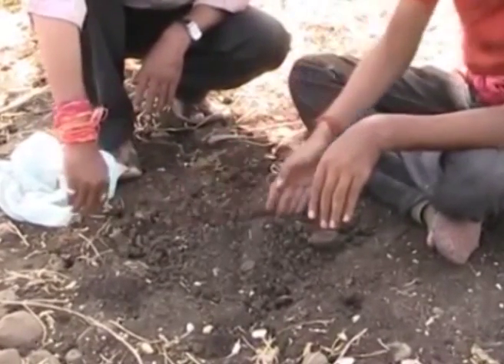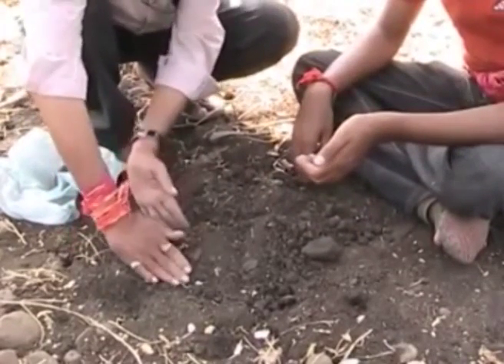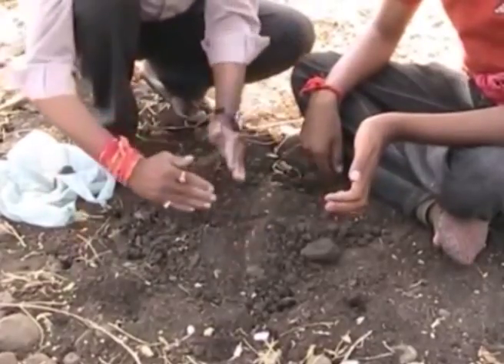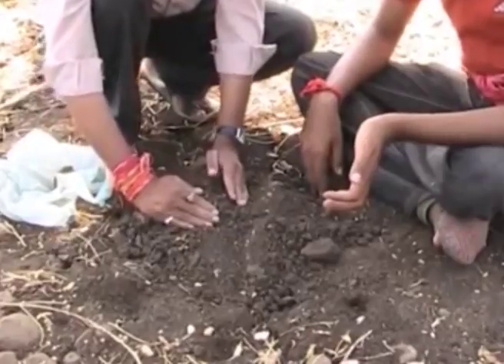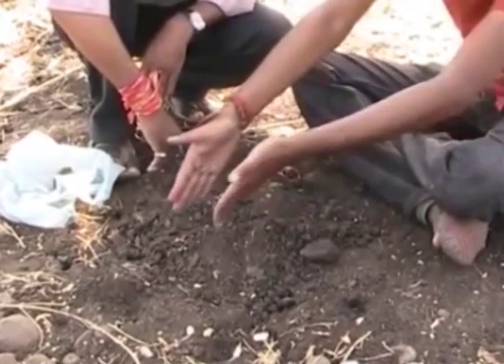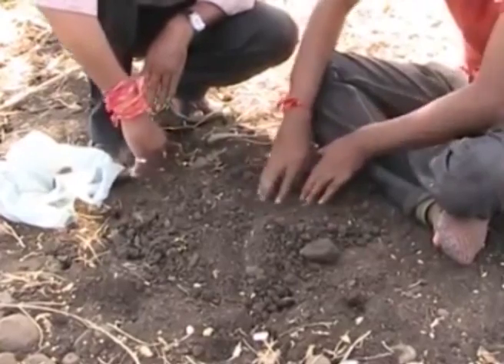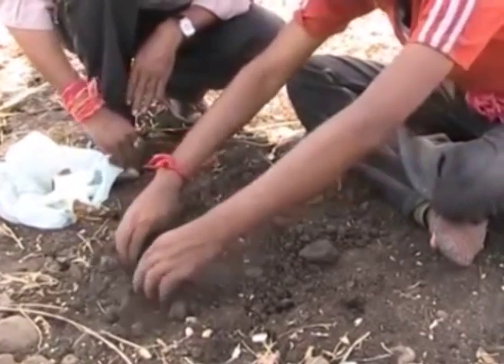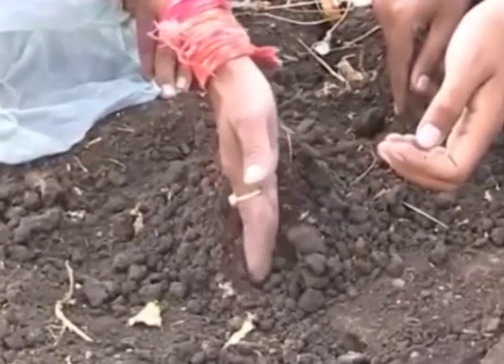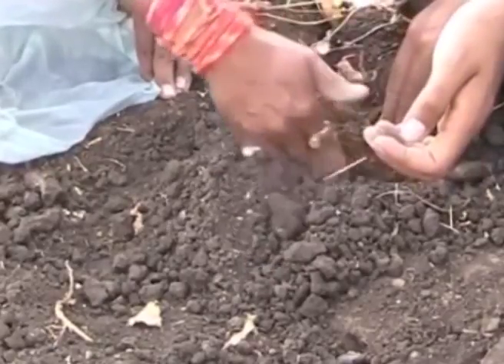It should be ensured that the soil samples are protected from extremes of temperature. Also, the samples should not be allowed to sit in direct sunlight in the field, even for a short time. In order to achieve this, samples should be packed in insulated containers and placed in a cool environment. Once in the laboratory, samples can be stored in a refrigerator until the nematodes are processed for extraction.